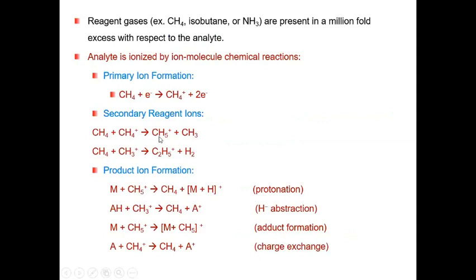Then we will get CH5 plus, and this C2H5 plus or CH5 plus will be used to ionize the neutral molecule from the sample.